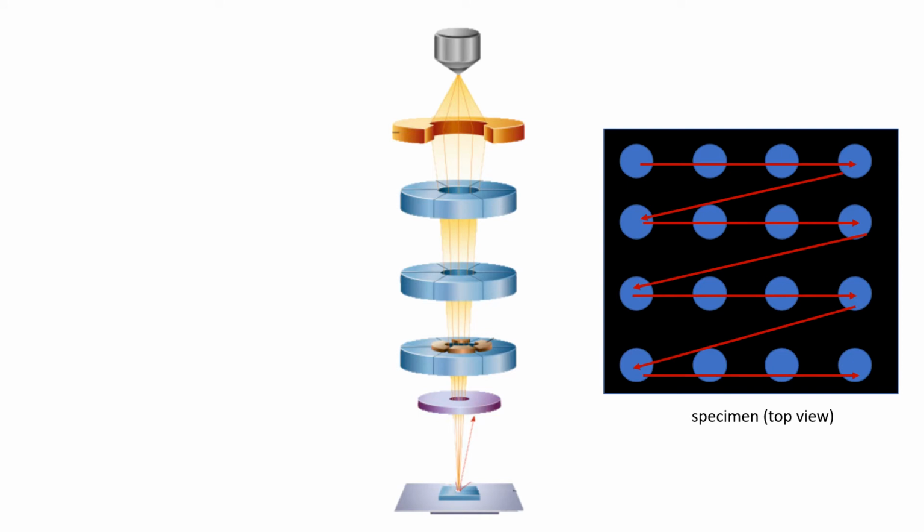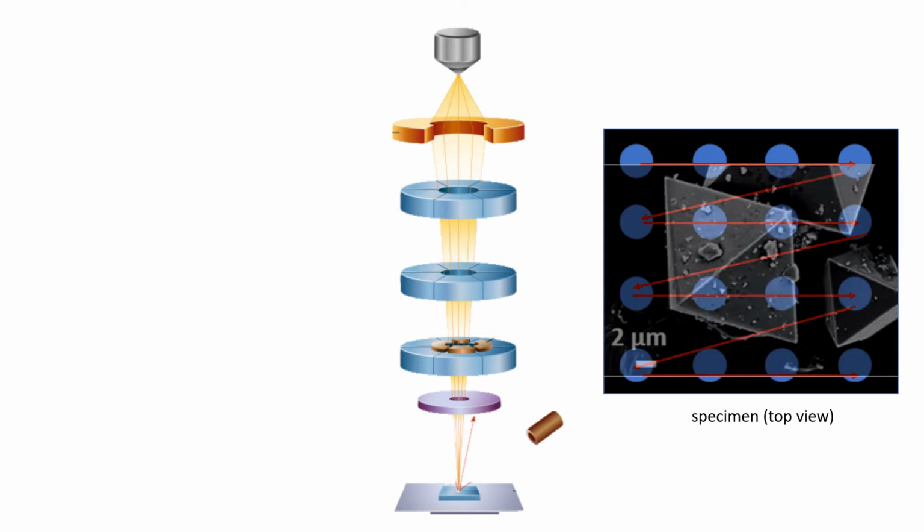The cathode bombards these closely spaced points with incident electrons over an equal amount of time and displaces the low-energy electrons in your sample. These displaced electrons are called secondary electrons. A detector attracts these secondary electrons and quantifies them per point. When no secondary electrons are detected, a black pixel is seen on the computer screen. The more electrons that the detector detects, the lighter the pixel will appear. Once the raster scan is completed, we will now see a magnified image of the unknown sample.